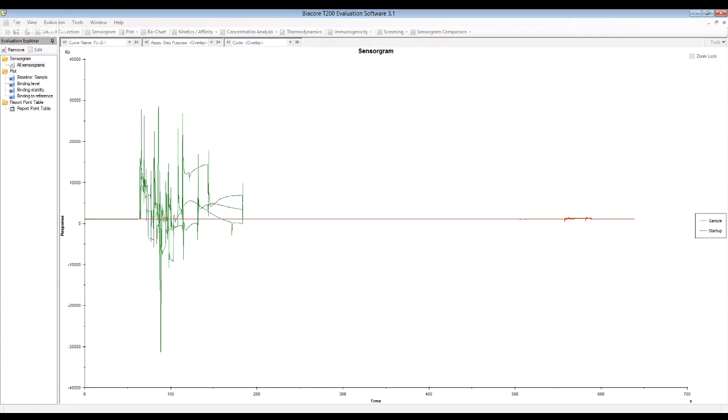Now the next screen I get is our blank subtracted sensorgrams. It has already subtracted the 0 concentration. In this screen, let's say you have some spikes in your data, something that will interfere with calculating your on rates, off rates, etc. You can remove the spikes in this particular view. Let's say I want to remove this. This actually does not interfere, but let me demonstrate how you remove something.